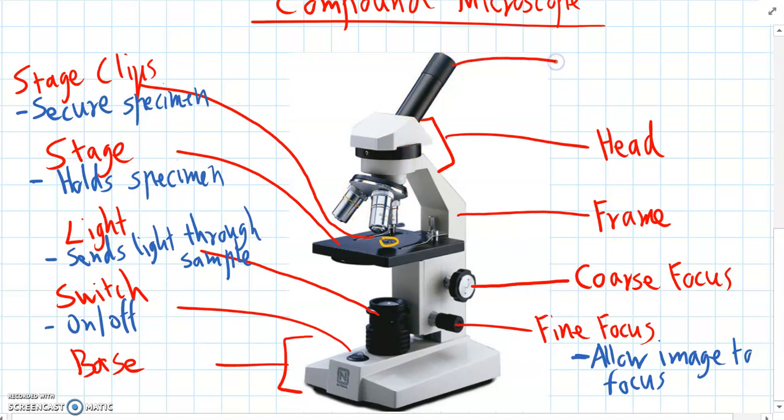So the top part we have the eyepiece lens. This is the lens that we look through to actually see the image.